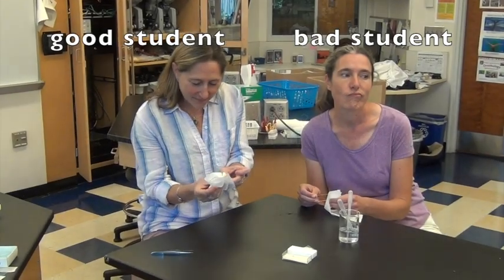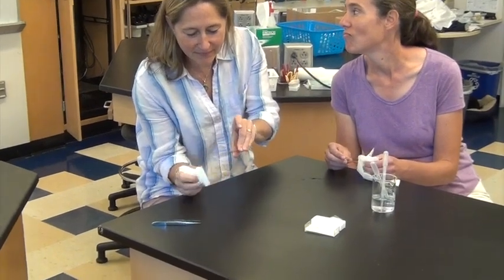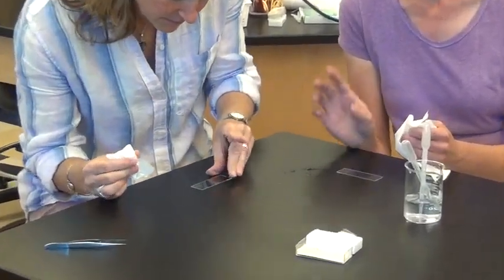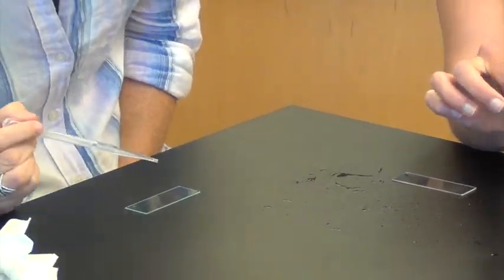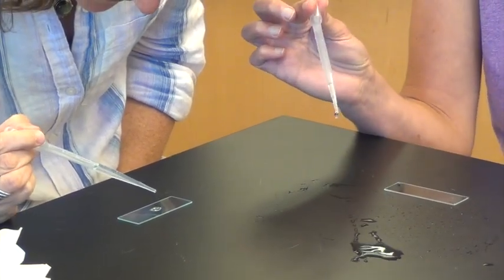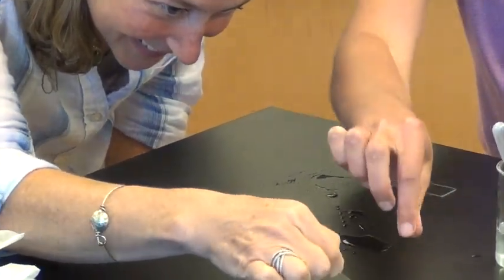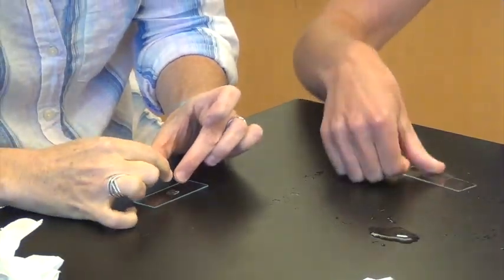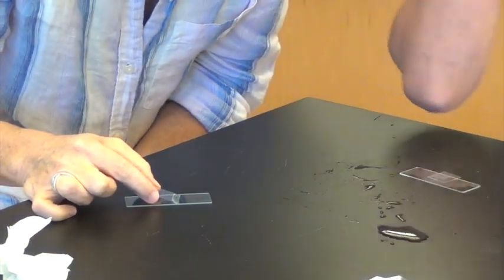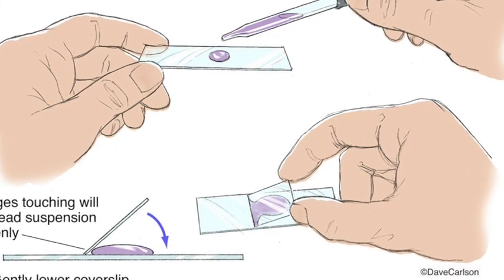Let's watch a good student and a bad student preparing a wet mount slide. Notice the good student makes sure the slide is clean and fingerprint-free — she holds it on the edges. After putting her specimen on, she puts a few drops of water on the specimen. Notice the bad student isn't paying attention. Then she takes one cover slip — be careful to take just one — touches it to the edge of the water and drops it. That will create a slide with no air bubbles. Make sure the bottom of your slide is dry and there's no extra water on top of the cover slip.